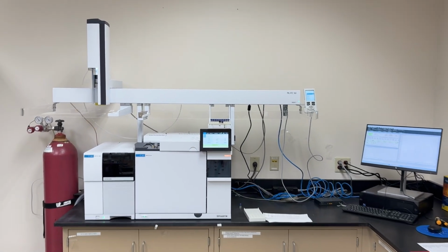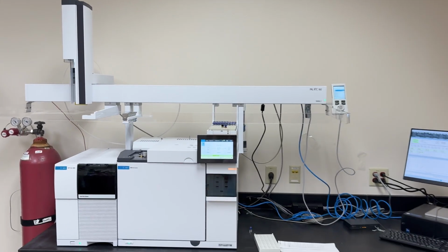This video is going to get you started running this instrument, which is the same instrument as the GC-FID, the Agilent 8890 GC, but instead of an FID detector, it has a mass spectrometer, an Agilent 5977 MSD single quadrupole electron ionization source mass spectrometer.